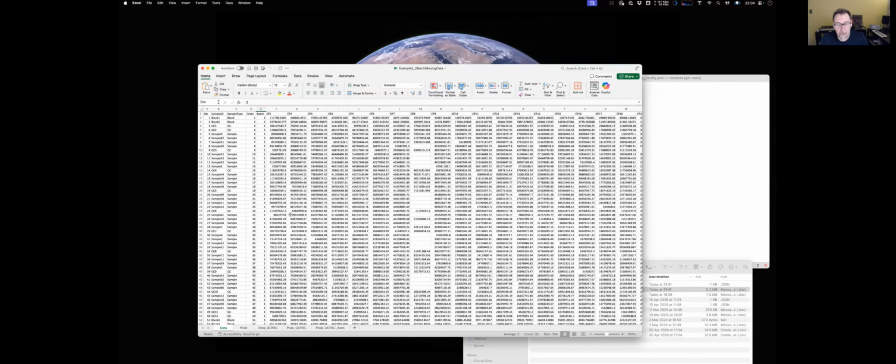When we first started looking at this, we used an artificial Sigma standard for the QC, but then that's limited to the metabolites that you detect in that. So we ended up throwing away a lot of detected metabolites because they weren't in that standard mix, even though it was from humans, but it wasn't for that study.